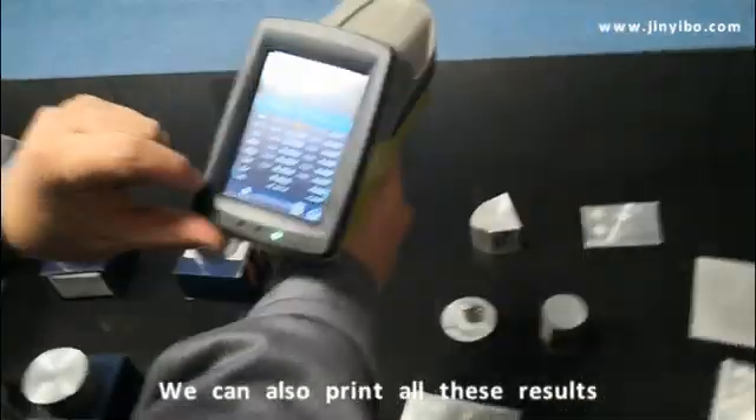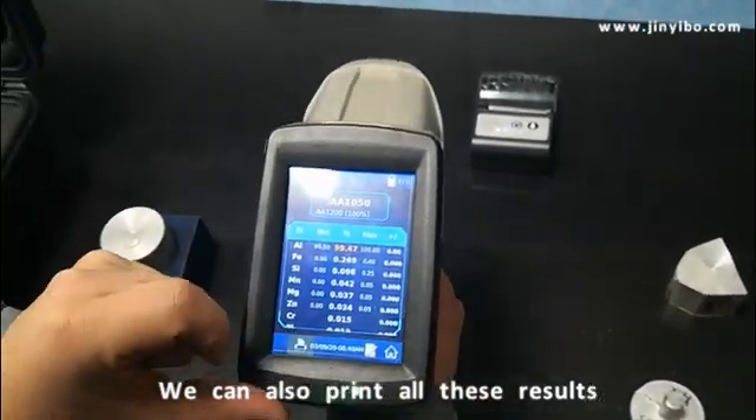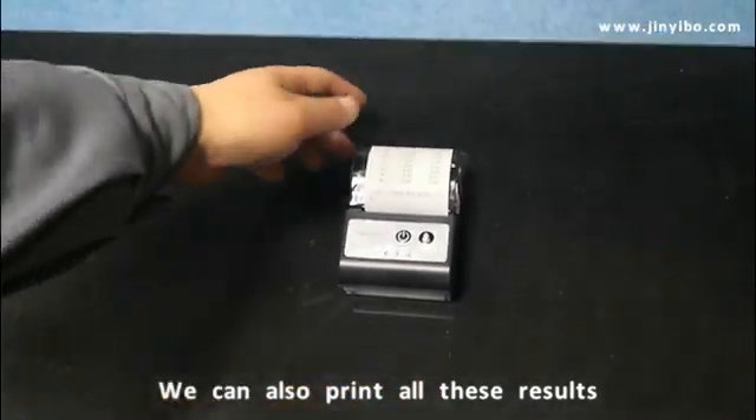Now we move to the printer. We just press here, press here. So the results are out.